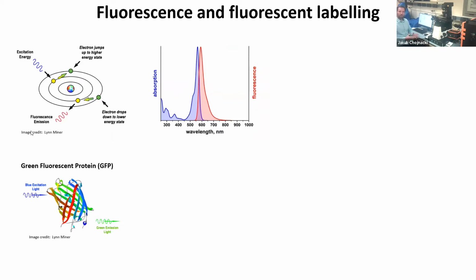However, proteins are often very big, so we also have another alternative, the so-called organic dyes. And organic dyes, as you can see, are much smaller molecules, because a protein is much bigger than a small chemical compound like this. So as scientists, we also have the possibility to use very small dyes, which we can attach to structures of interest, like proteins, or lipids, or sugars. And those molecules also will fluoresce with a specific light.